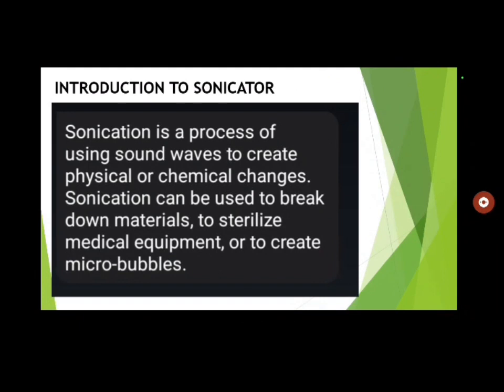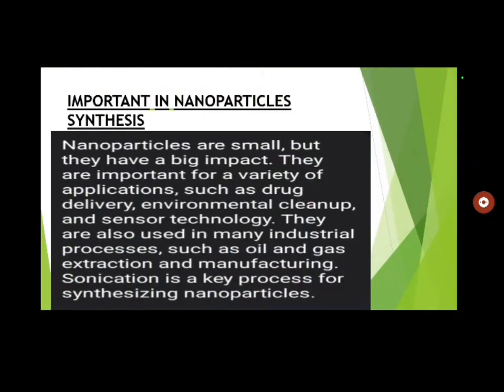So what is the sonication process actually? Sonication is a process of using sound waves to create physical or chemical changes. Sonication can be used to break down materials, to sterilize medical equipment, or create microbubbles.